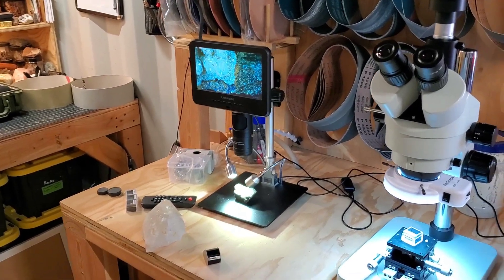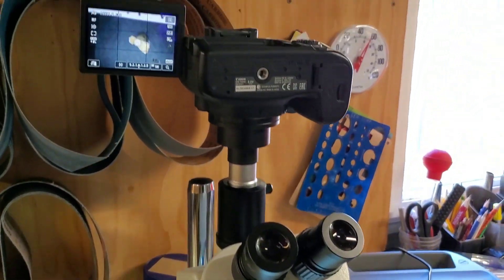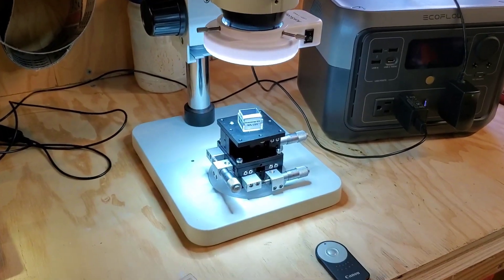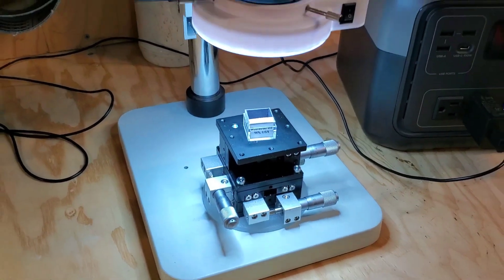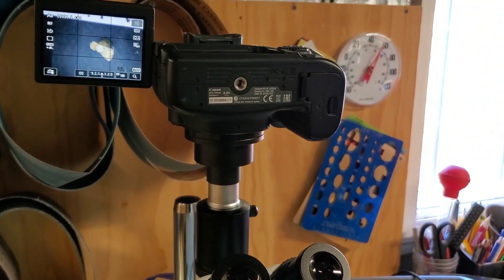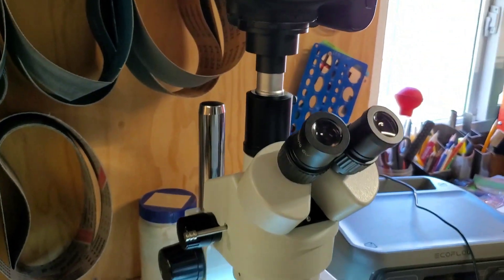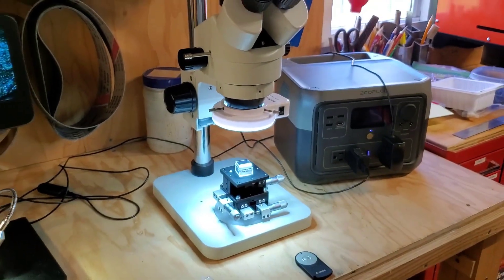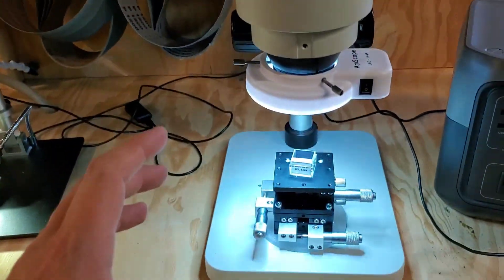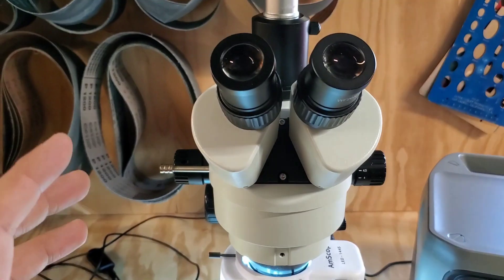Before we talk about the digital, I want to talk about this. This is a trinocular optical microscope. We have an XYZ platform down at the bottom, a ring light, two holes for looking in, an adapter, a Canon 70D body, and this is what I use to primarily look at minerals and take photos of minerals using the camera. It's great, and I'll give you a little taste of what that's like.